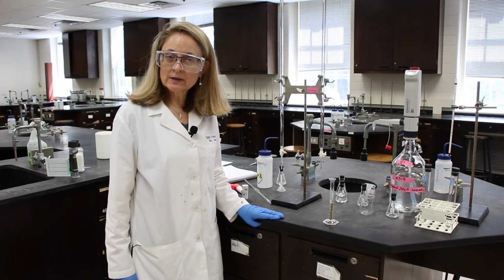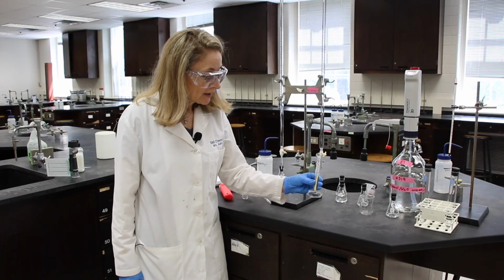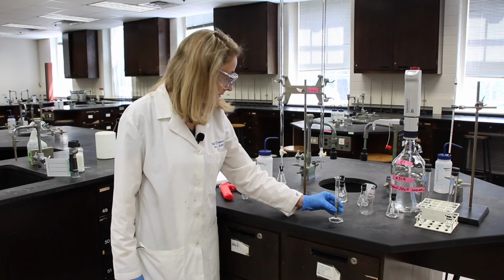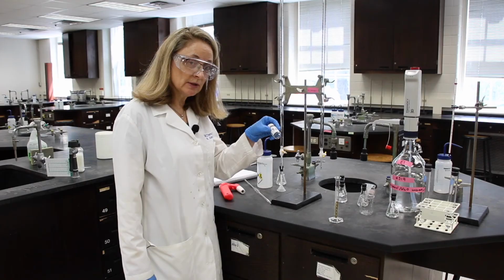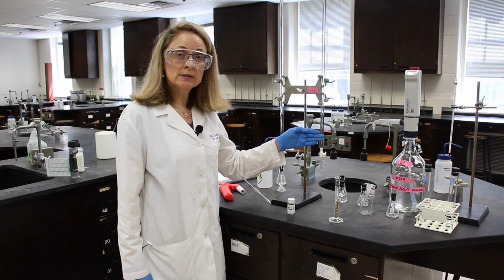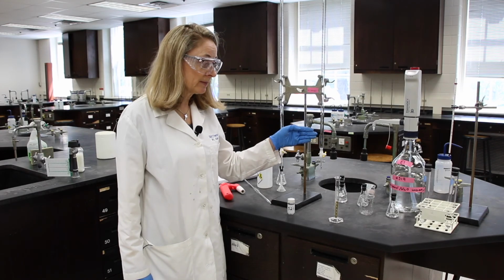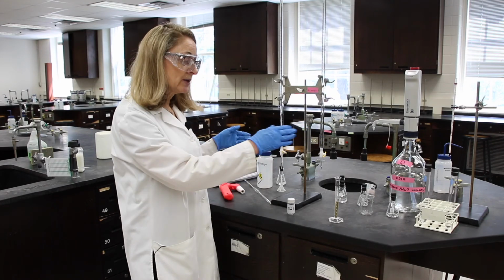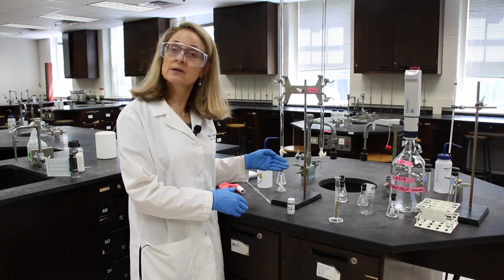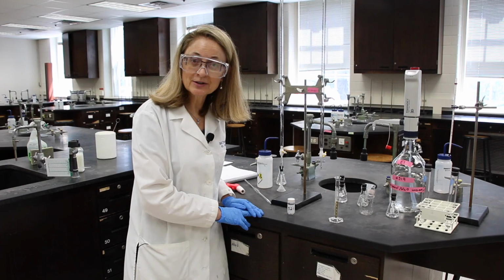Now that we're done with the lab, we need to clean up. We need to completely dry the solid and return it to its original container. We need to rinse the burettes with DI water and then flip them and open the stopcock. And then we need to arrange all of our equipment neatly so the next group can use it. Thank you for being my lab partner.